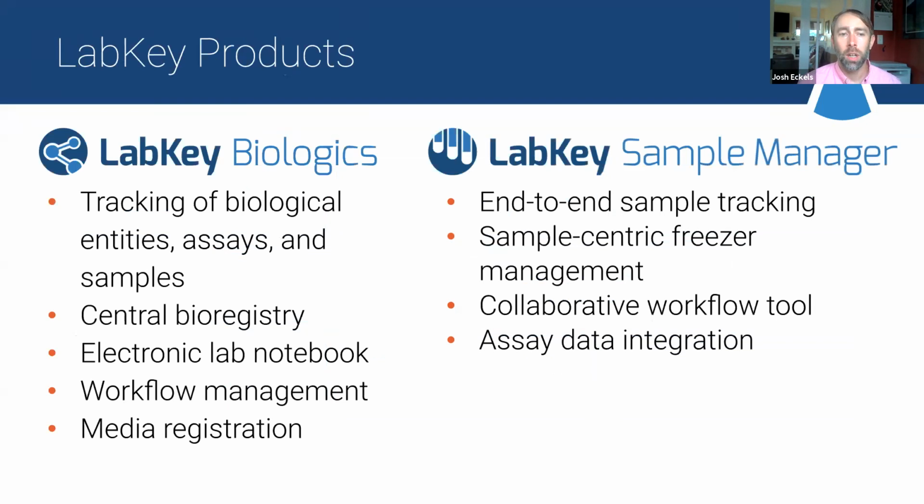So Biologics is our product that is really purpose-built for full biological entity assay and sample tracking, to take that full workflow of developing, characterizing, and refining those biologic therapeutics through the whole pipeline, having an electronic lab notebook, an ELN, kind of annotating and capturing that data, and really easing the workflow and data management side.